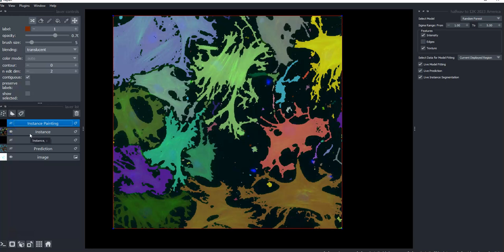Okay, so I think that's it for this video. This was some challenging stuff here. It didn't all go perfectly smoothly, I don't think, but in the end, I'm kind of pleased with what we got here. Anyway, that's it for this video.